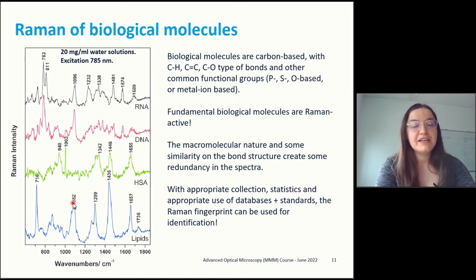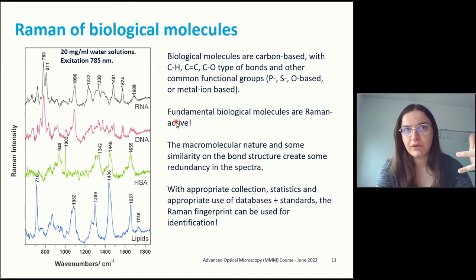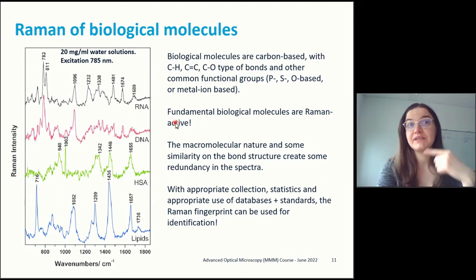And especially the macromolecular biological molecule will have a repeat arrangement that will actually create a series of features that are kind of unique.